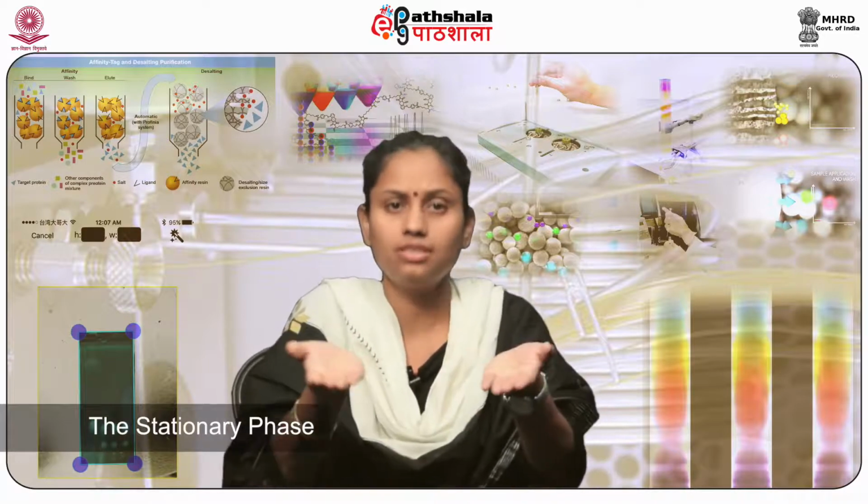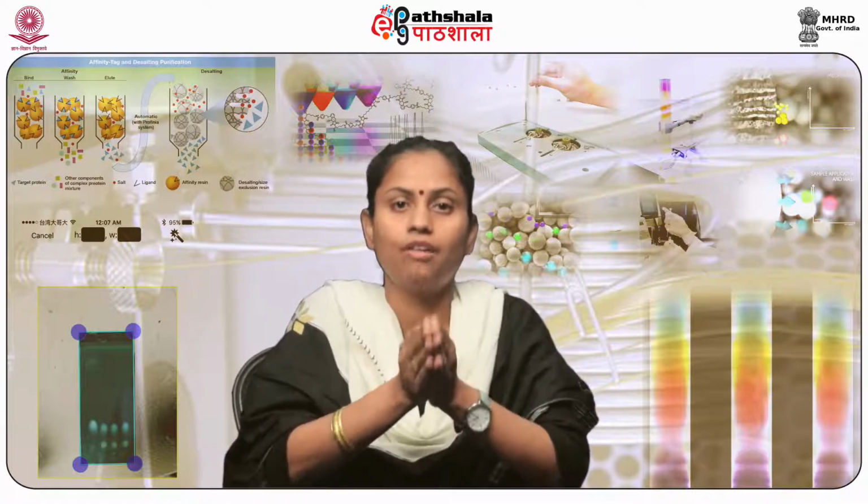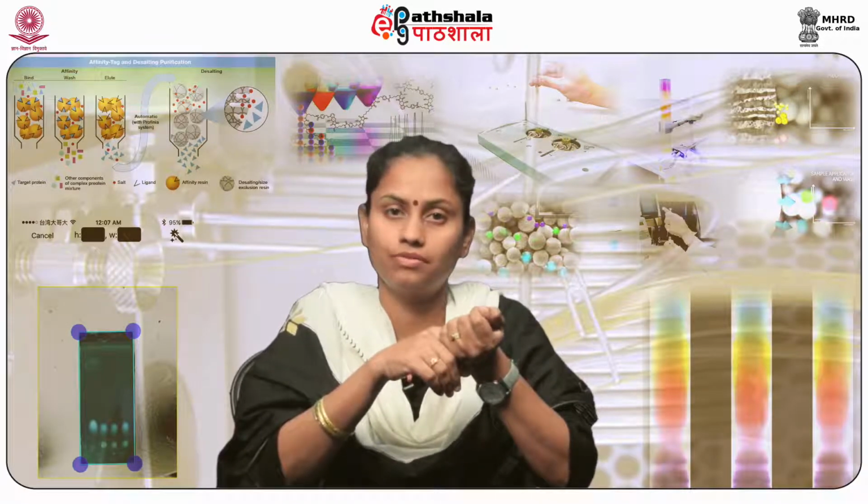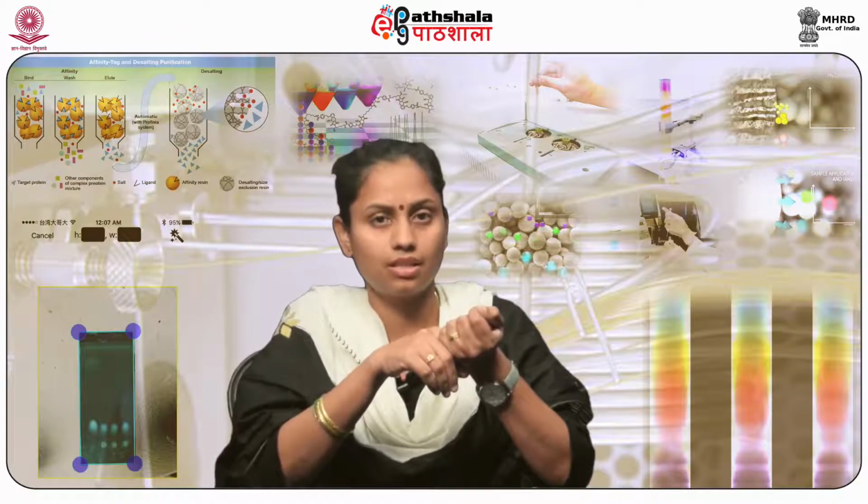So what is a stationary phase? This phase is usually fixed in place for carrying out the chromatographic procedure. A very simple example of a stationary phase is silica, which is used in thin layer chromatography. Another example is cellulose, which is used in paper chromatography.